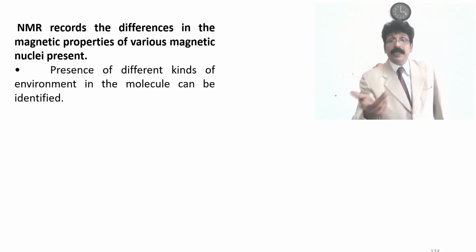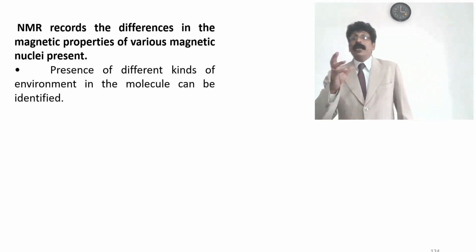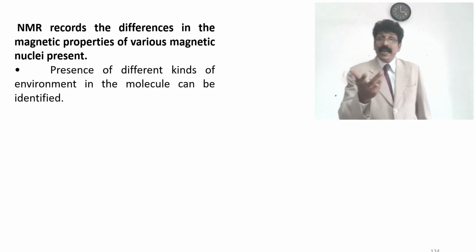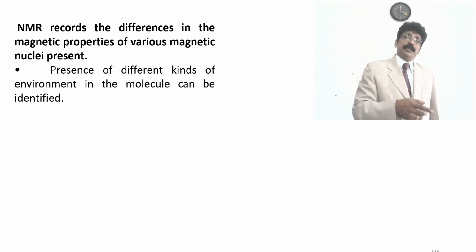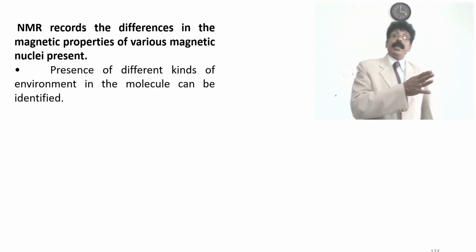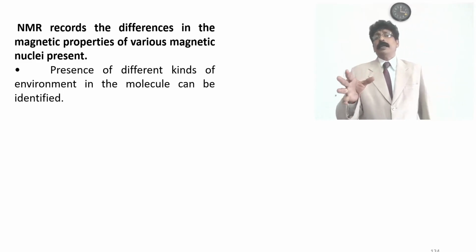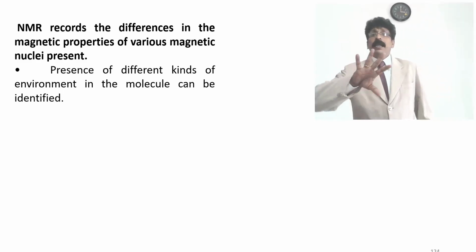That is where chemical shift comes in, and shielding and de-shielding also occur here. The delta value is compared with tetramethylsilane, but I am not going into detail.